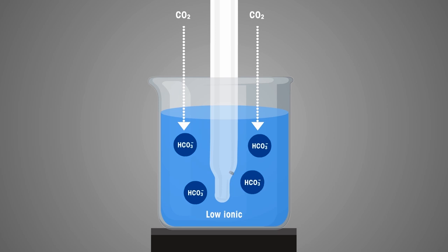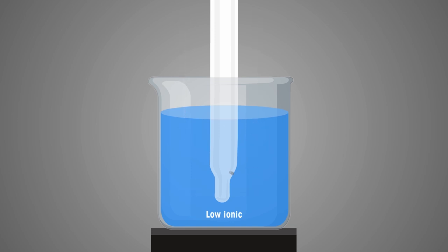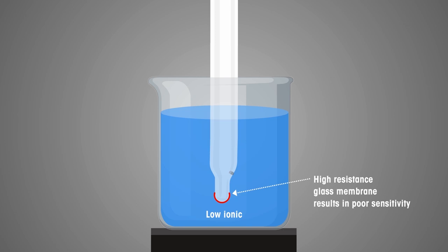The low ionic concentration also makes pure water susceptible to ingress of carbon dioxide from air. This absorbed atmospheric carbon dioxide becomes carbonic acid in the sample, causing the pH value to change and producing wrong results. Inaccurate results can also occur due to the lack of sensitivity of the high-resistance glass membrane for hydrogen ions in low ionic samples, meaning the pH value gets recorded without reaching equilibrium.